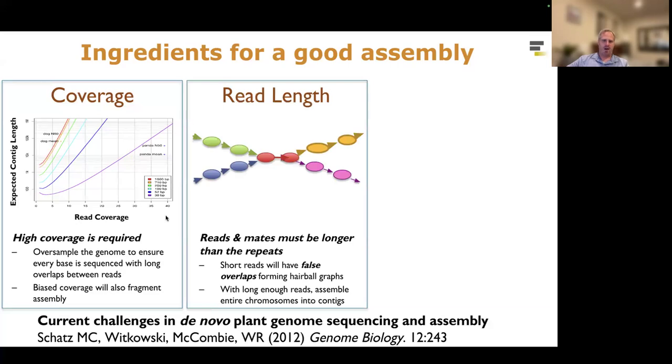The next ingredient is that we want our sequencing to be sufficiently long reads that we can resolve the repeats that are present there, or at least most of the repeats. So if we built a de Bruijn graph between these reads here, we could be uncertain about if we come in on the green edge, should we leave through orange or through pink here? But if we had longer reads, we could resolve this ambiguity and realize that green goes to orange and blue goes to pink there. The length that you need very much depends on the genome sequence that you're trying to assemble. As a rule of thumb, bacterial genomes are much smaller than, say, vertebrate genomes, so you can get away with shorter reads. But even still, if you want complete reference genomes for microbes or for vertebrates or other large eukaryotes, we generally want longer reads to get through the repetitive elements that are present there.